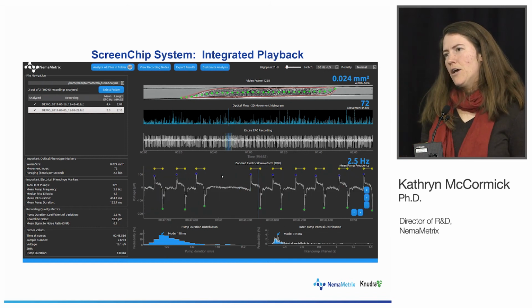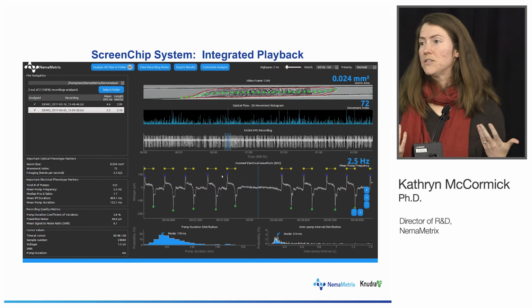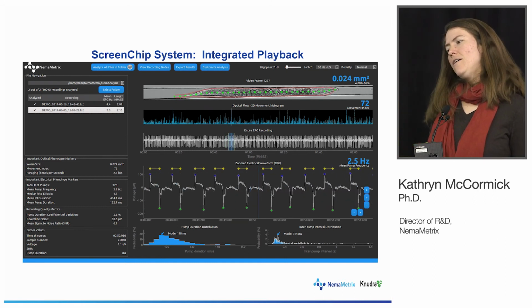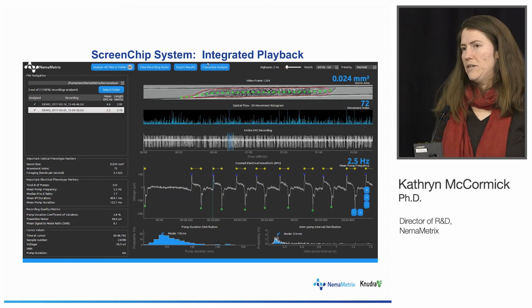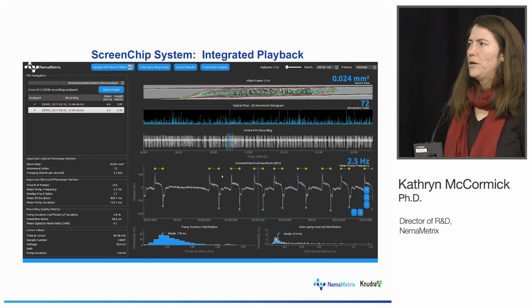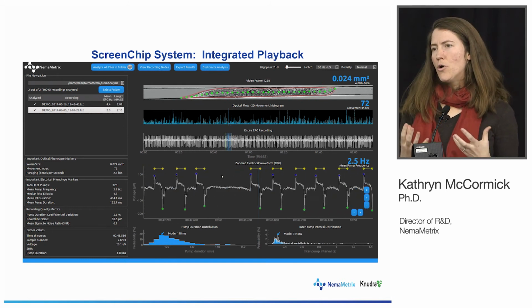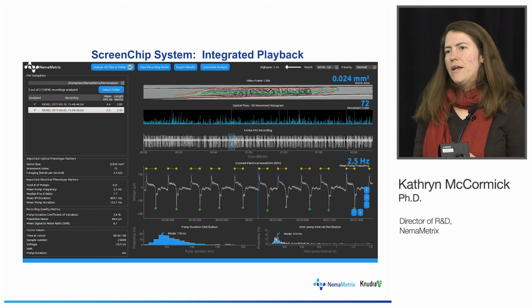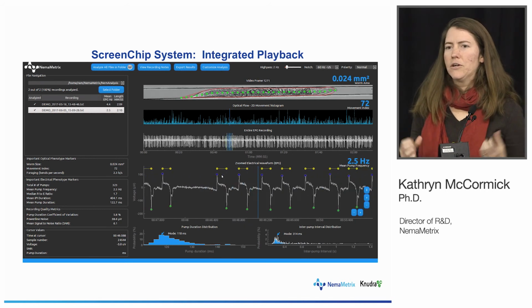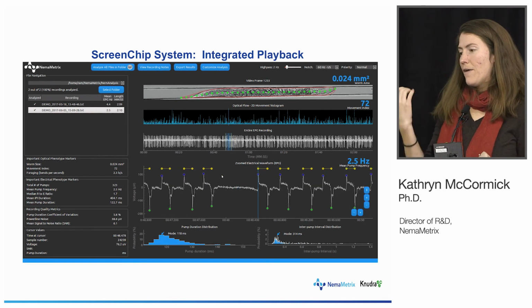It has an upward going peak, it has a downward going peak, there's a duration, there's an amplitude, there's a lot of detailed information inside the pharyngeal measurement that we take. And it's a good readout of neuromuscular function because there's a known number of cell types that create that pump, and there's a known number of muscles that have to contract in a coordinated manner to also create that waveform.